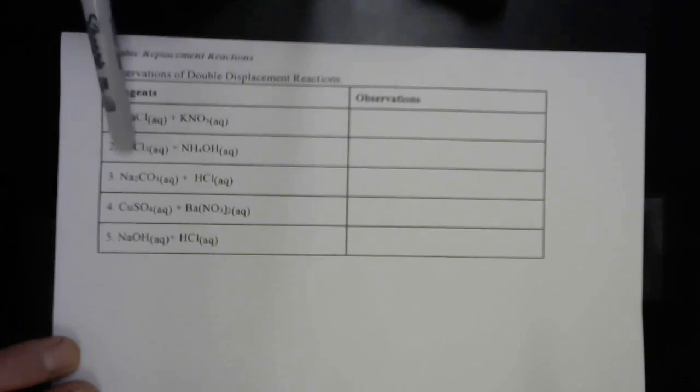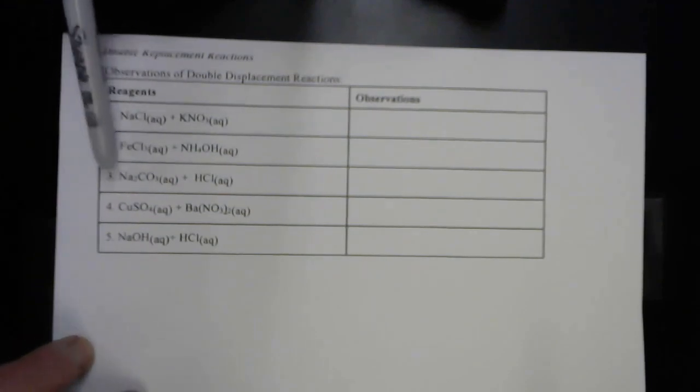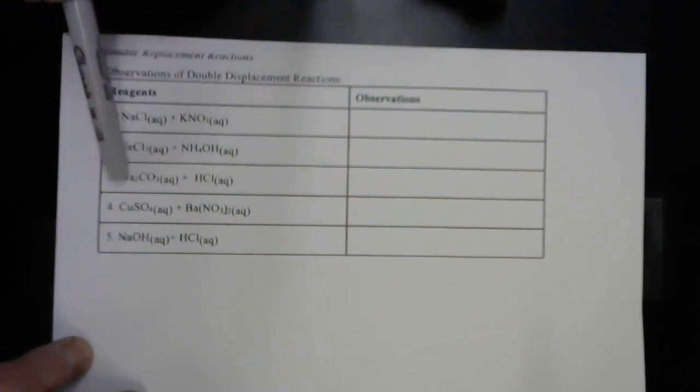And in that reaction, we saw a rust red precipitate form from the starting solution of iron chloride, which was pale yellow. Third reaction was sodium carbonate plus HCl. And that one I did 2 times, one in the little plate and then a larger one in the test tube, because it was a little hard to see the bubbles in the plate because of the video camera stuff.